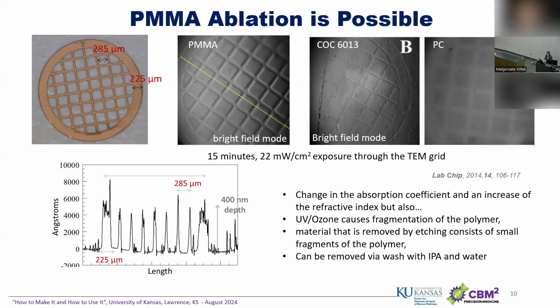Some polymers are susceptible to scissions, or what we call ablation: you can ablate the polymer if you expose it to UV light for a long time. This is the same process as when you were a kid and you left your plastic toy outside for the summer, and at the end of the summer it lost its color, right? That's basically what it is. We bleach it by the sun. We ablate the surface by constant exposure to the UV rays. This UV lamp, that's what it is. It's just we do it fast in a high intensity mode, so we can do this activation pretty fast.